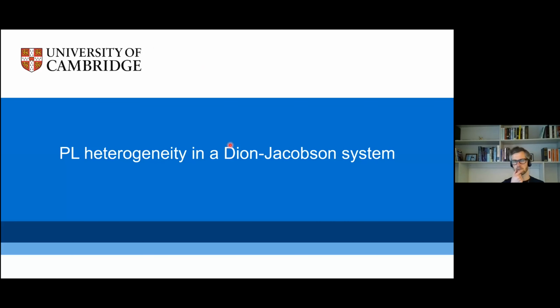Good. So far for the first part, this was broad emission bands, then two-dimensional perovskites, defects, and it was all explained in a model that assumed we had some sort of homogeneous material. And microscopy obviously helped very much because the flakes were small, and we could nicely observe that in the flakes there were no effects from the facets, for example. It was the entire flake or different regions of the flake that either showed a lot of defects or few defects.